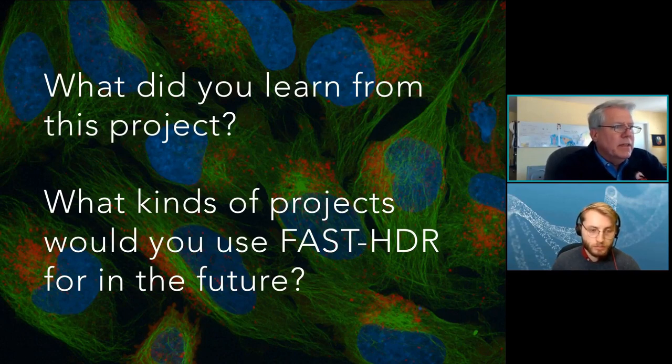So there are ways to work around some of the challenges we faced. And I think starting with some of the other cell lines the ExpressCells team has had a lot of experience with, which have the characteristics that make for a better likelihood of a successful project, I think we would want to do it all over again with them.